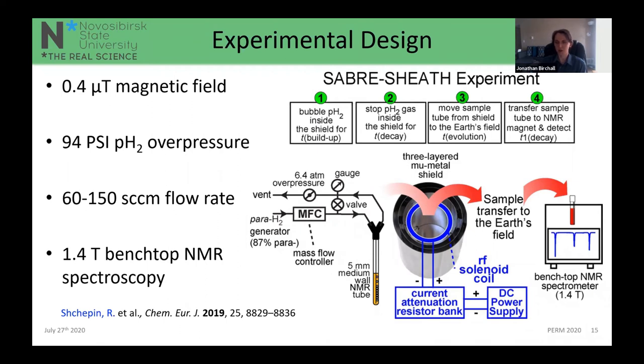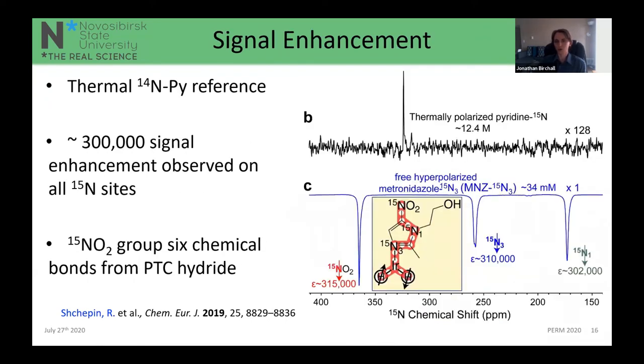The experiment was performed in a simple NMR tube transferred into a 1.4 T benchtop spectrometer. We build up polarization inside the shield with hydrogen bubbling, stop the bubbling, transfer to the 1.4 T spectrometer, and observe the signal. Using thermal ¹⁴N pyridine as a reference, we observed a 300,000-fold signal enhancement across all three ¹⁵N sites — N3, N1, and the nitro group ¹⁵NO₂. The pyridine reference spectrum was scaled up 128-fold to make the comparison visible.